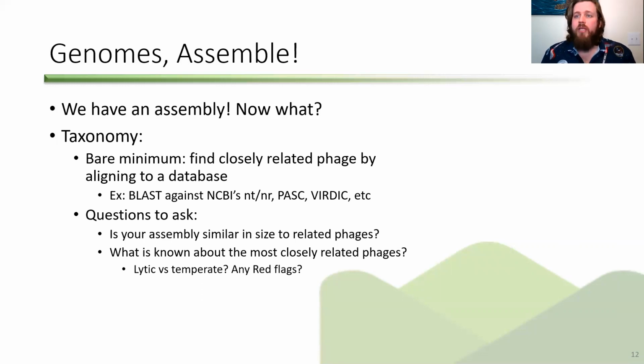It doesn't necessarily mean that you can't use your phage just because related species have something like that, but it does mean that you should look more closely and you should zero in on that and make absolutely sure that that's not also in your phage.